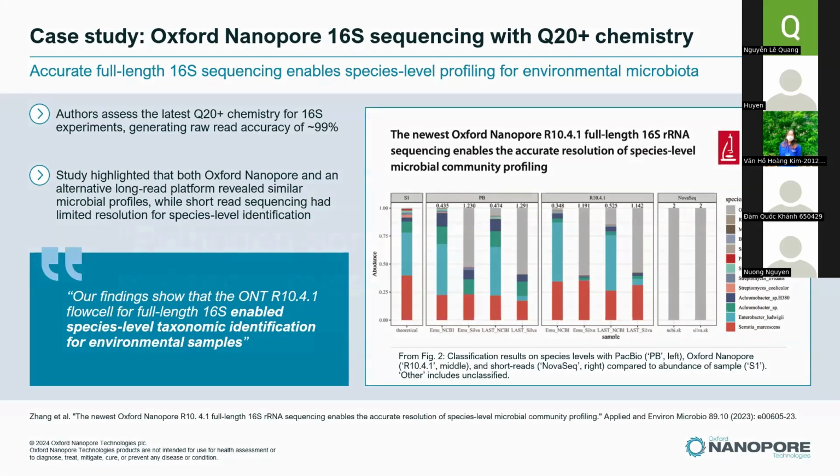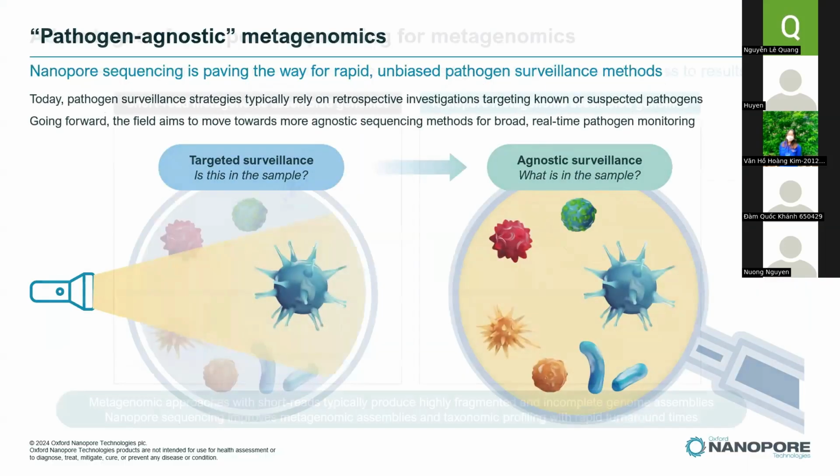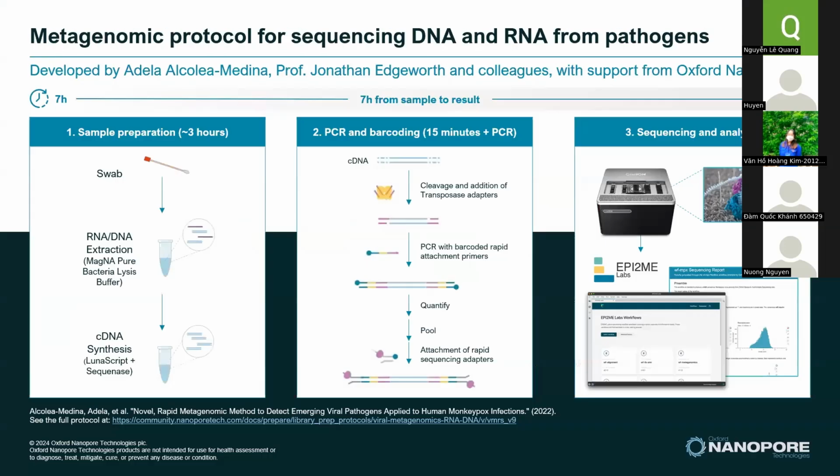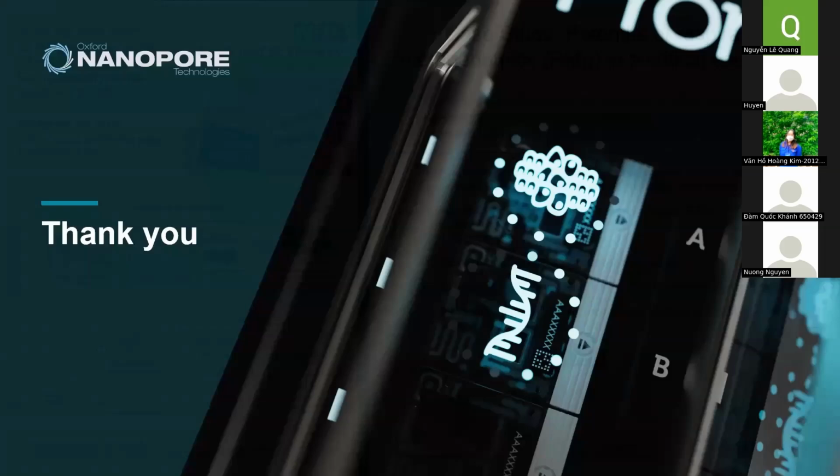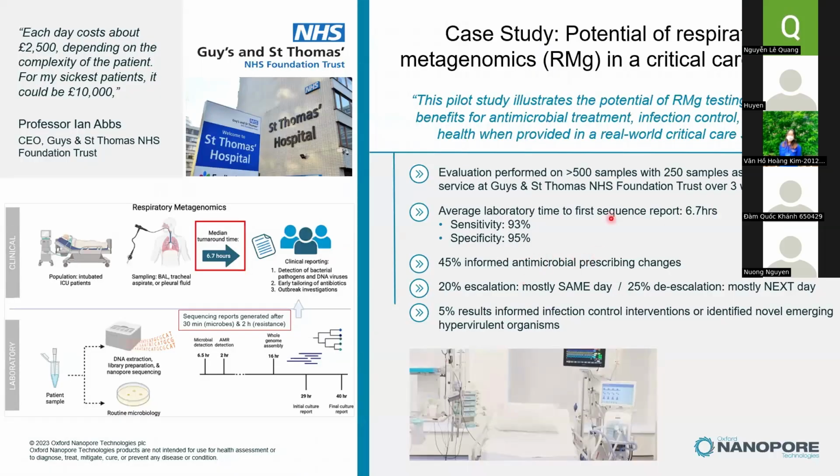So for implementation, in fact, this particular study is in ICU settings, it is clinical. It happened at Guy's and St Thomas' in the UK. One of the PIs, his name is Professor Jonathan Edgeworth. He is one of the lead PIs for this program.